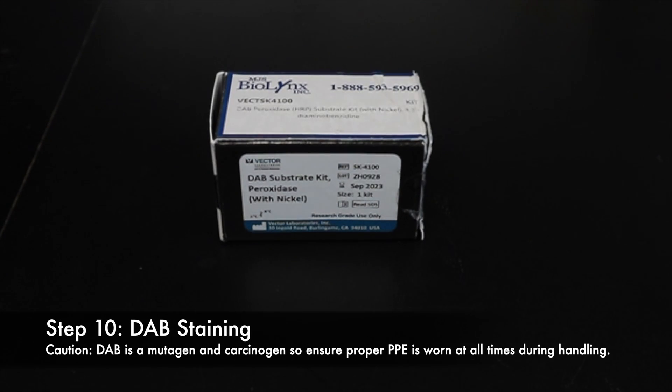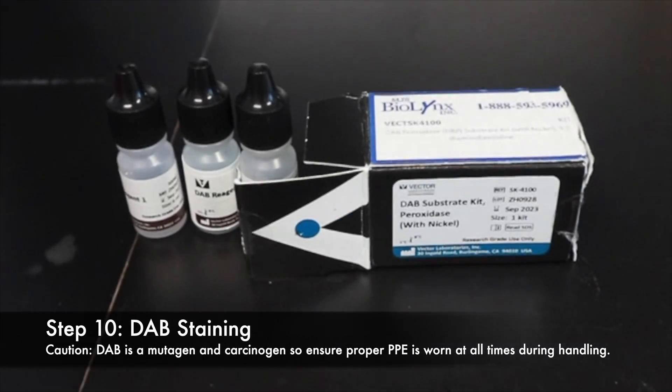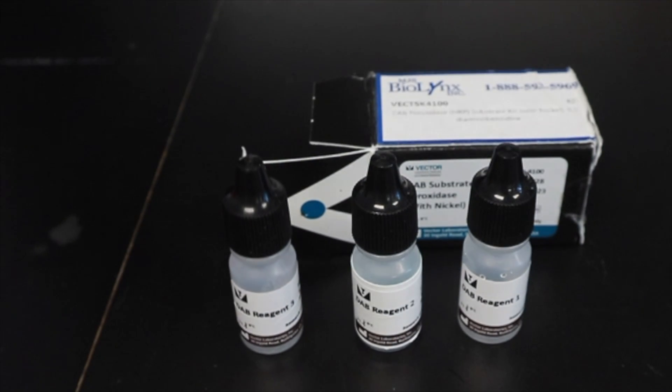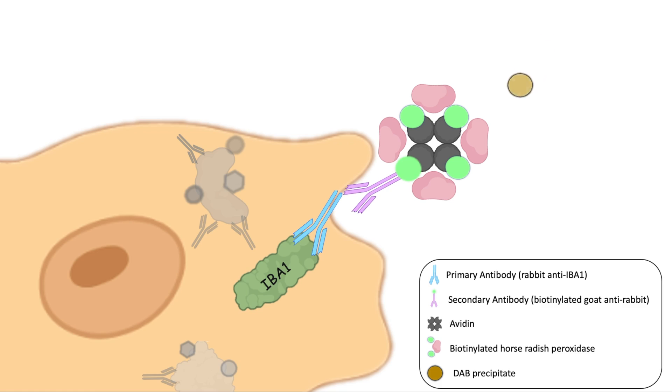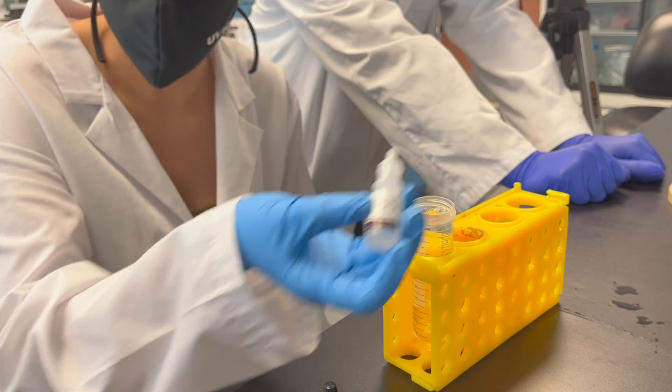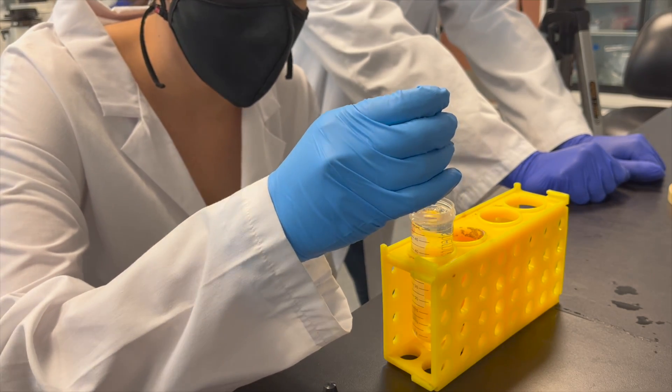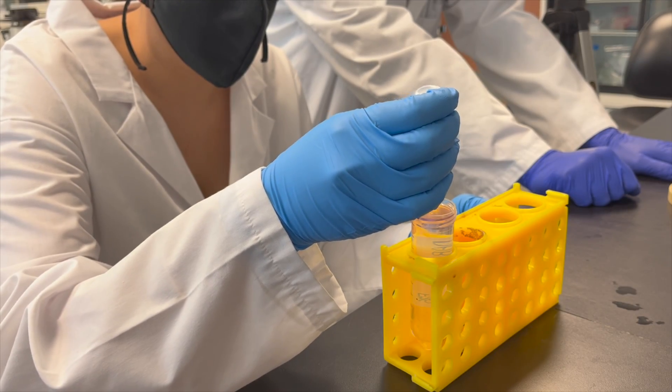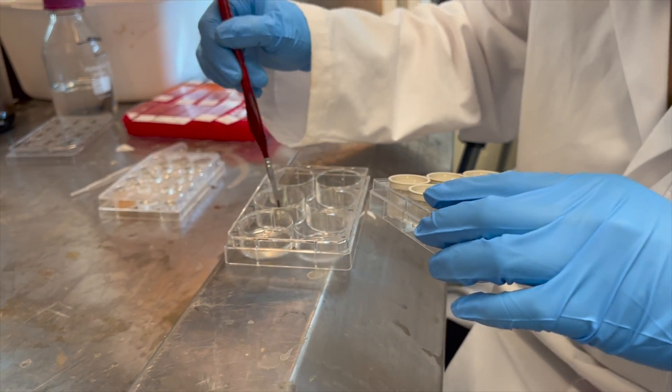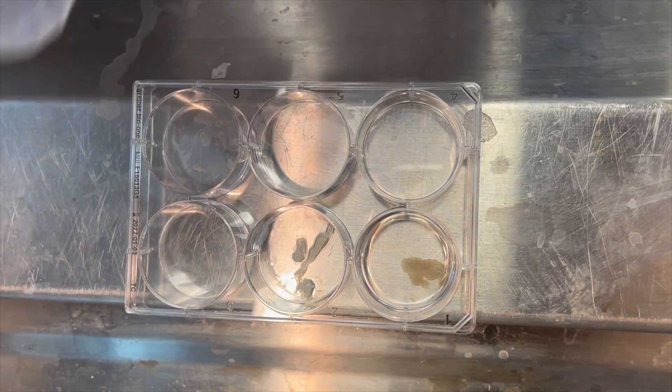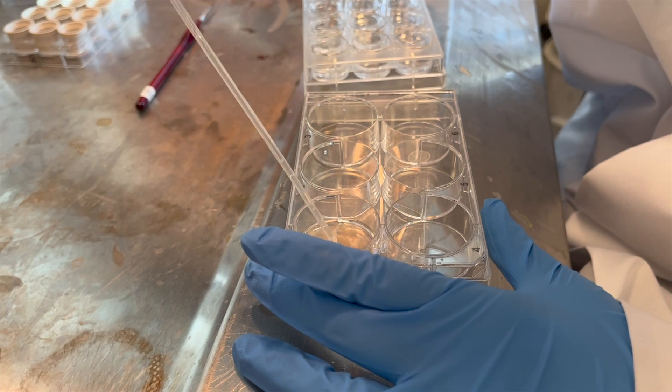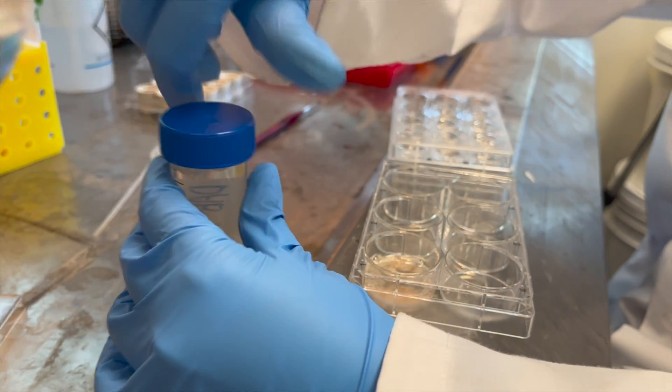We will now be using reagents 1, 2, and 3 from this DAB substrate kit from Vector Laboratories. DAB, or 3,3-diaminobenzidine, is a chromogen that is oxidized by horseradish peroxidase to form a brown precipitate in IBA1-positive cells. To make the DAB solution, add 2 drops of reagent A, 4 drops reagent B, and 2 drops of reagent C for every 5 milliliters of distilled water. Then, working under a fume hood, transfer the tissue to a new plate and add 1 milliliter of DAB solution to each well using a transfer pipette.